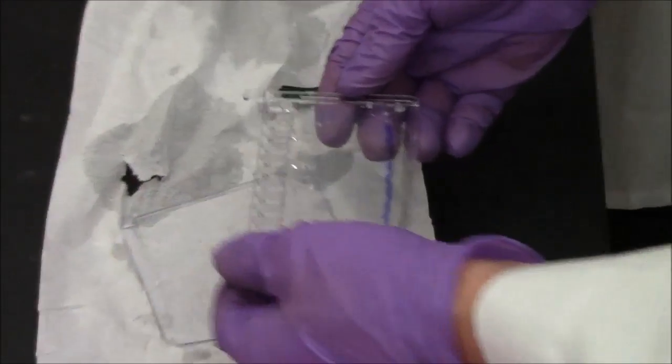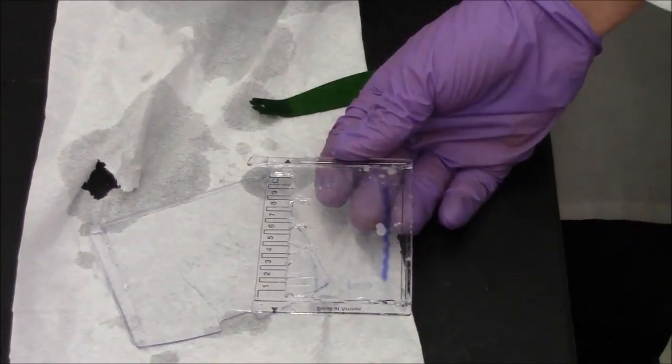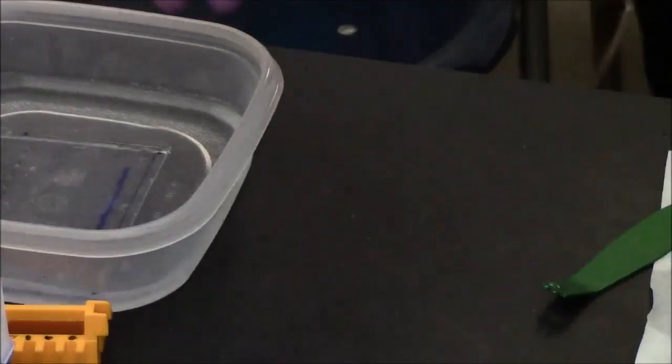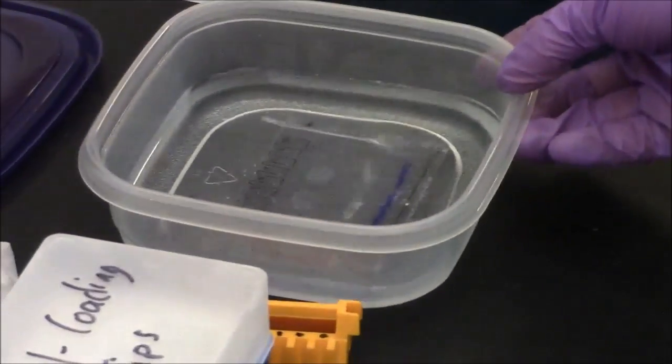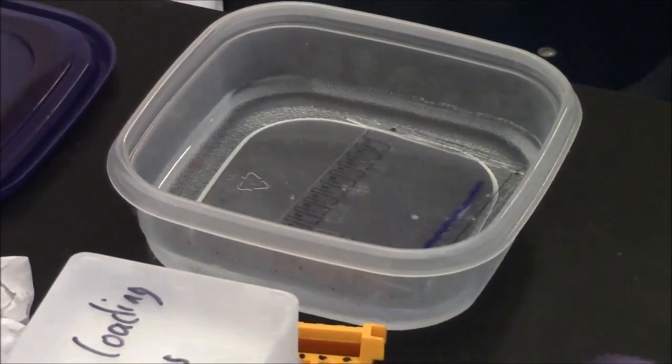Usually the gel will adhere to one of the two plates, doesn't really matter which one it sticks to, and then we want to float the gel off of the plate by immersing it in distilled water and gently shaking.